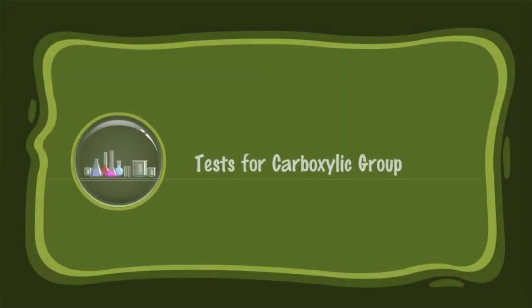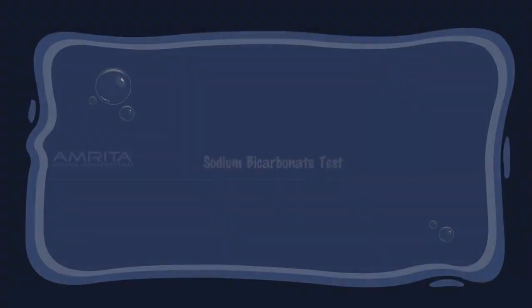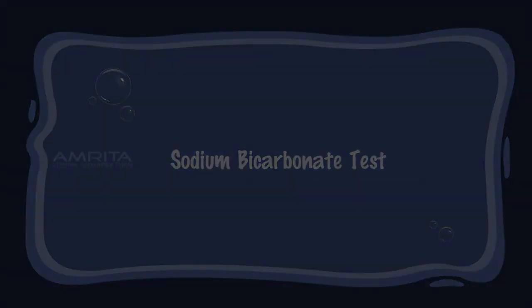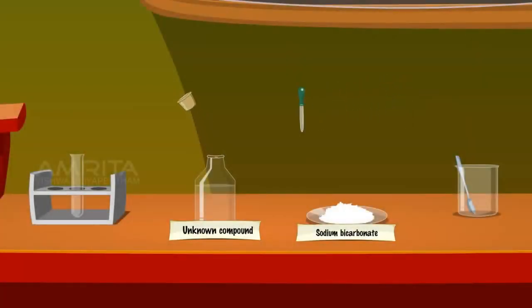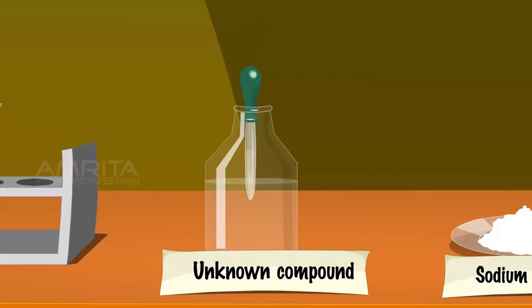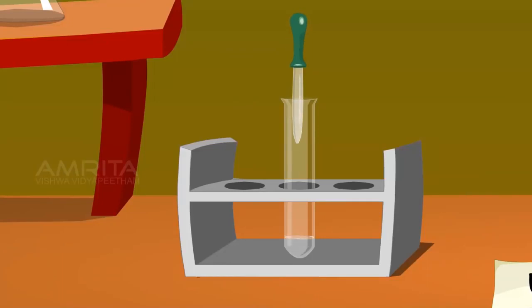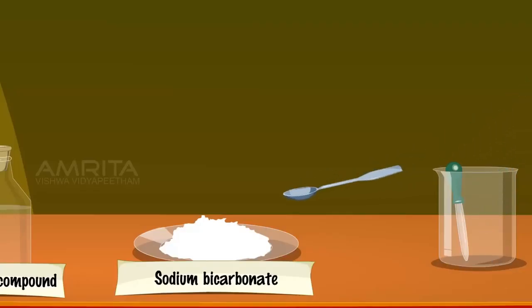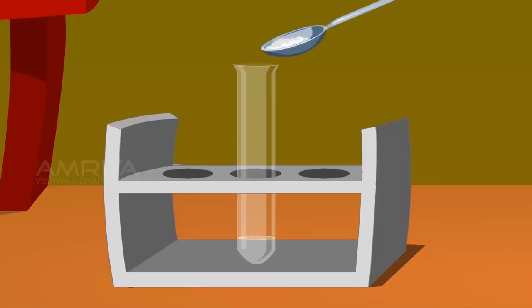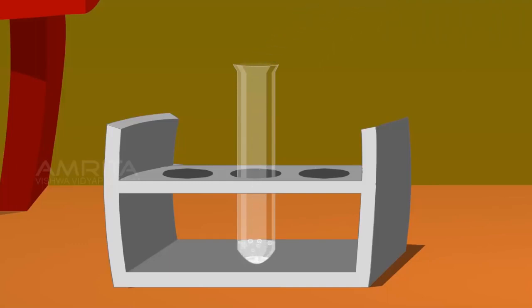Test for carboxylic group — Sodium bicarbonate test. Procedure: Take a dropper and take a few drops of unknown solution, add it into the test tube. Take a small quantity of sodium bicarbonate using a spatula and add it into the test tube. Carboxylic acid reacts with sodium bicarbonate to produce brisk effervescence due to the formation of carbon dioxide gas.